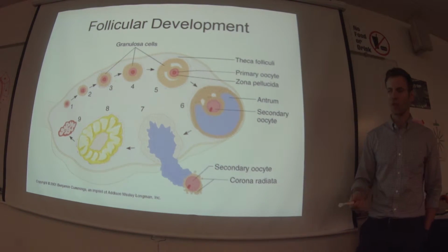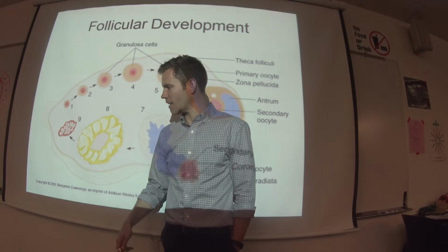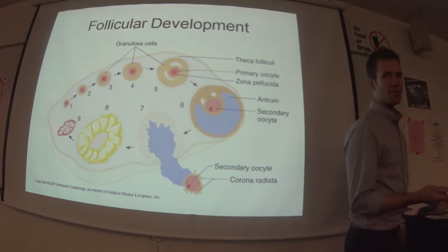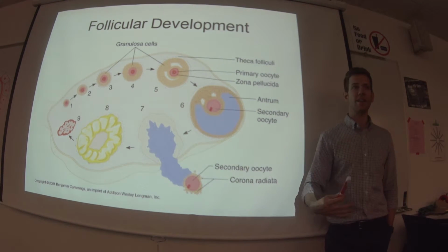You'll see under a microscope, it doesn't even stain. It's really light, kind of like that light pink color right there. So it doesn't seem to be a very active tissue at all, whereas corpus luteum stains a lot. It's a very active live tissue.